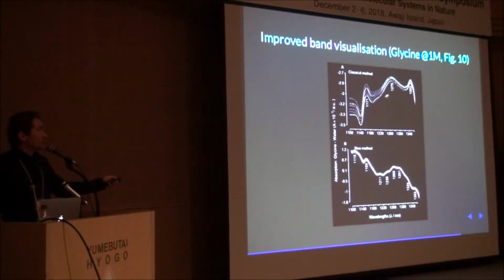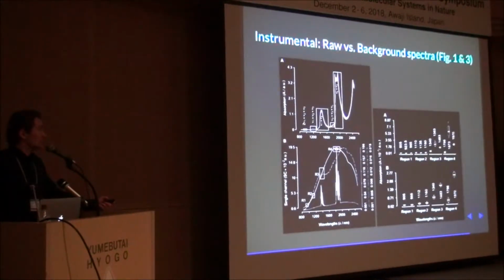Now, it's hard to do it here. It's hard even to guess how many bands there are, but there are a lot of bands. Technically, chemically speaking, this is still a region where CH overlaps with NH. We're talking about glycine, we're talking about amino acids, so we do have NH. But there is a lot more information if you take a little bit of care with water.